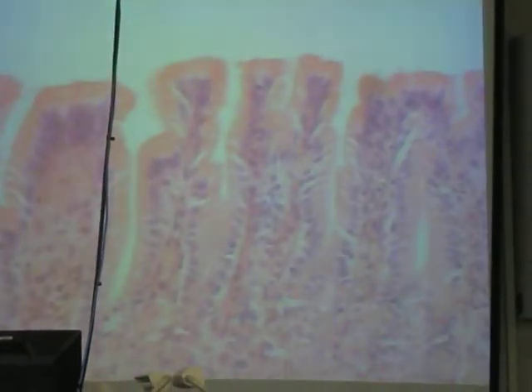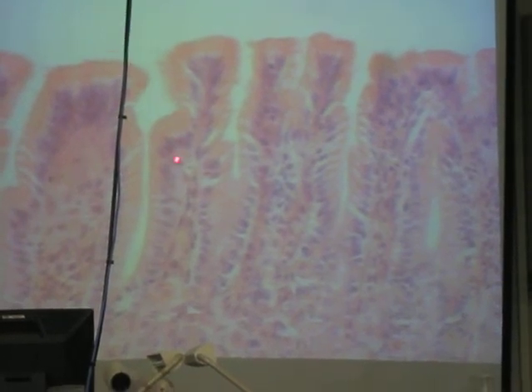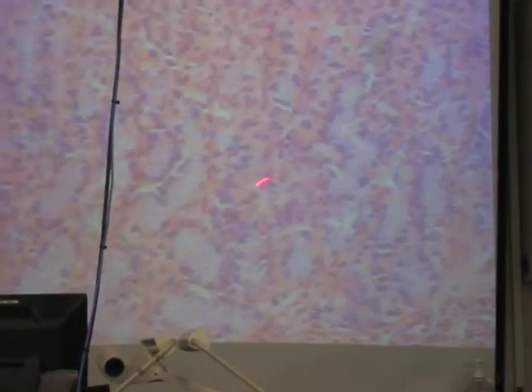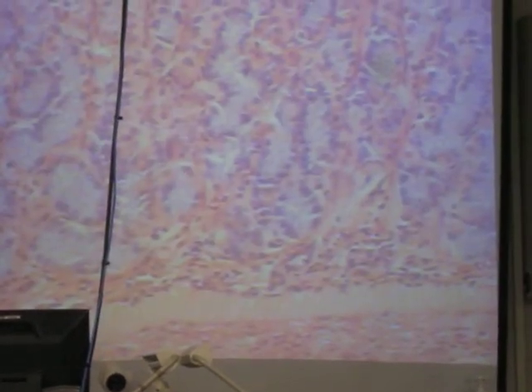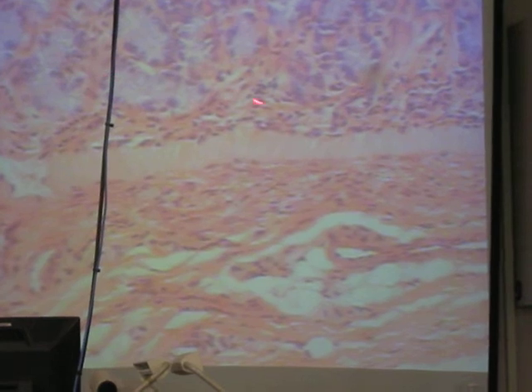So that's the first couple things you should be looking for on the stomach slide. Find a good segment where you can identify the epithelium, the gastric pits, the gastric glands, and then differentiate the cells. Well, as you run deeper, you can see some other stuff.